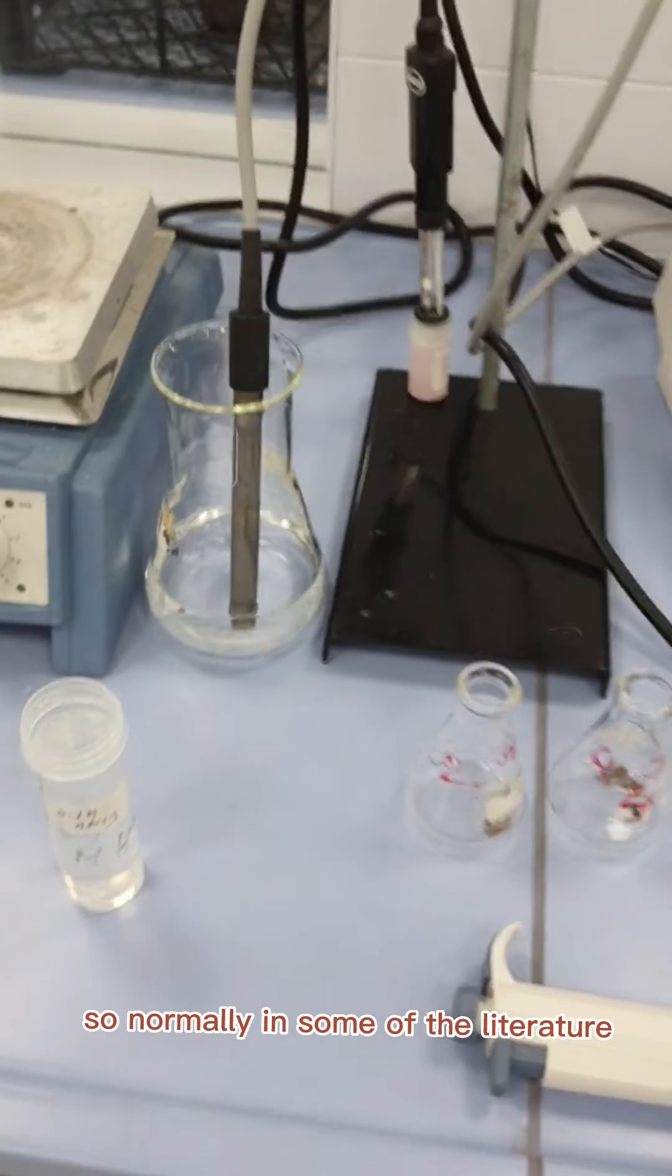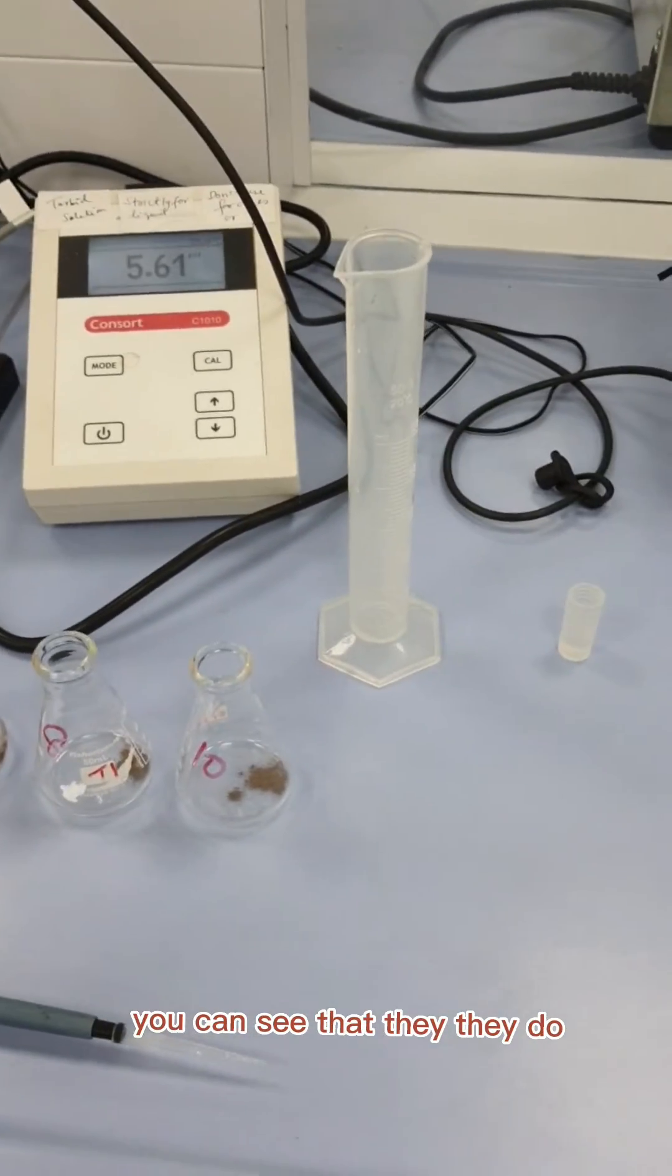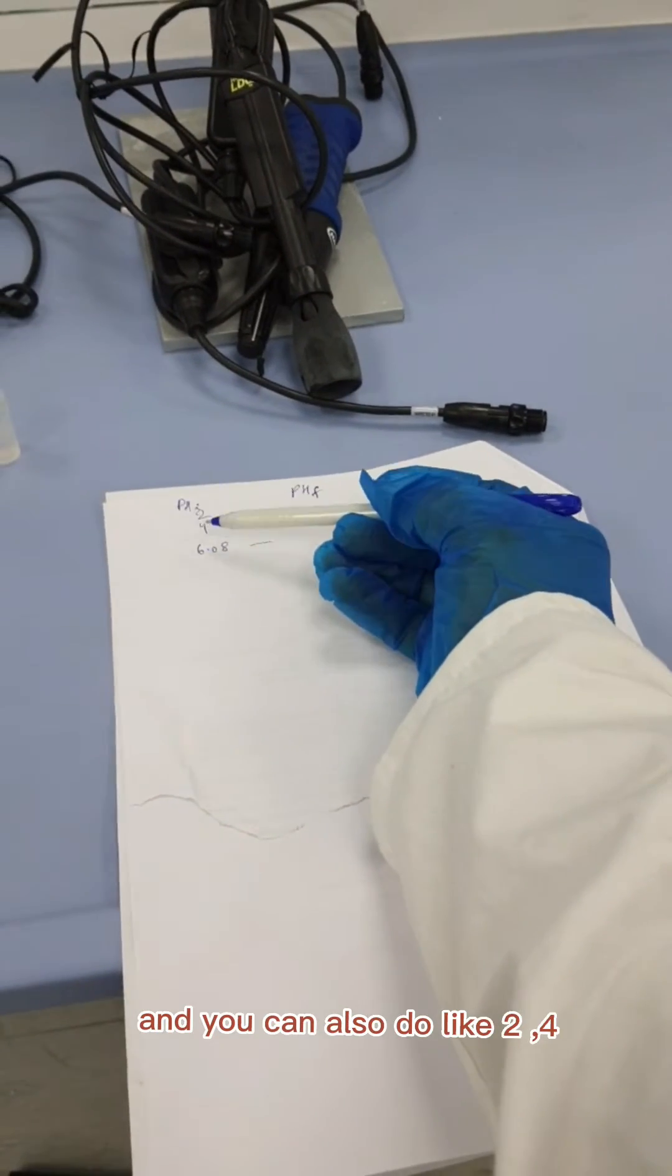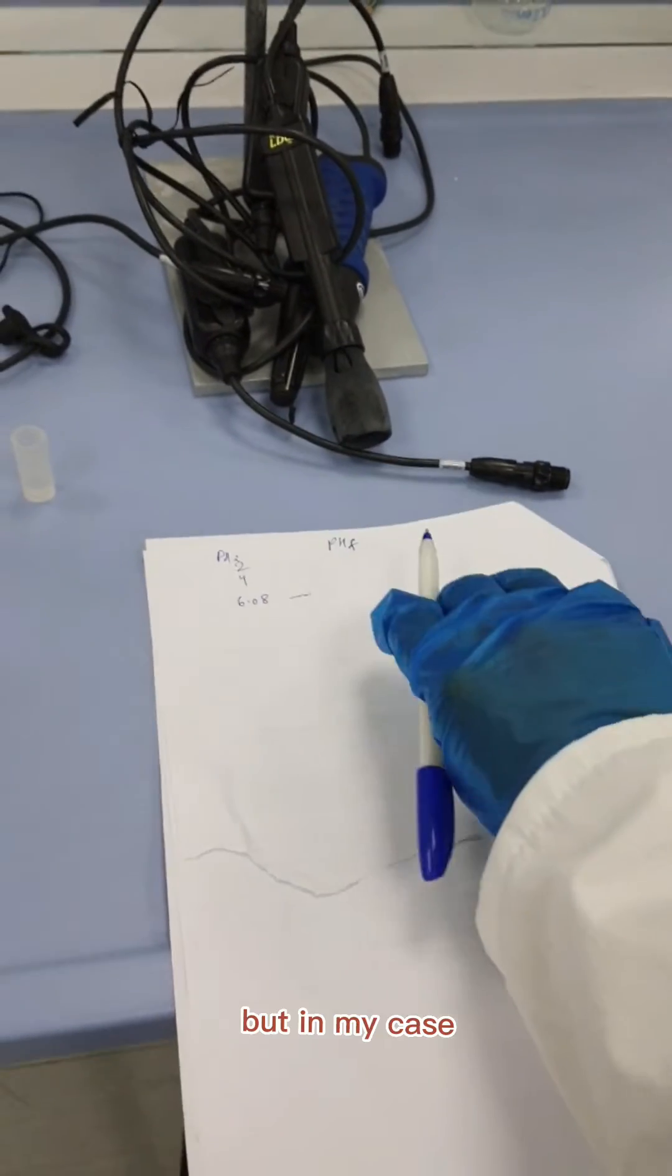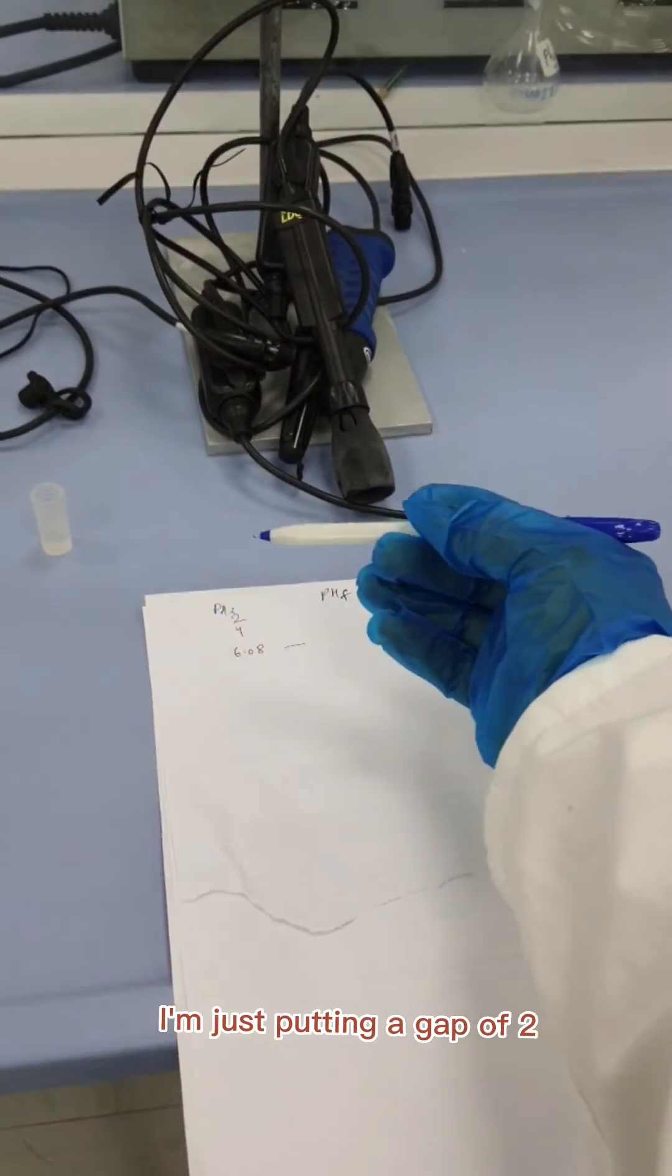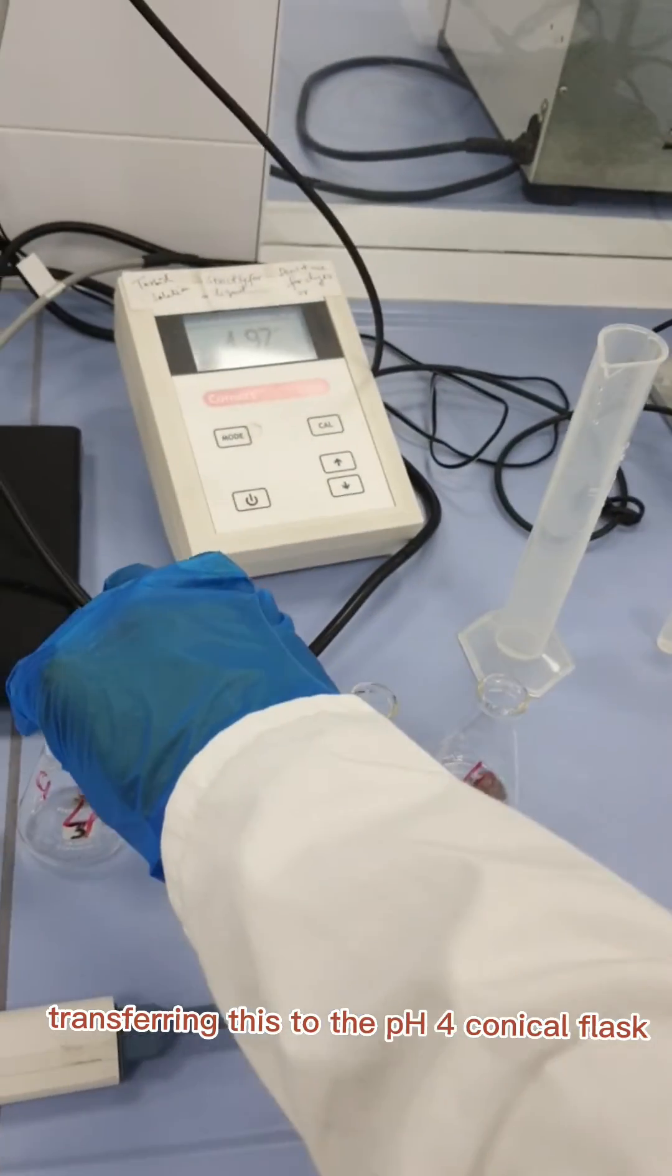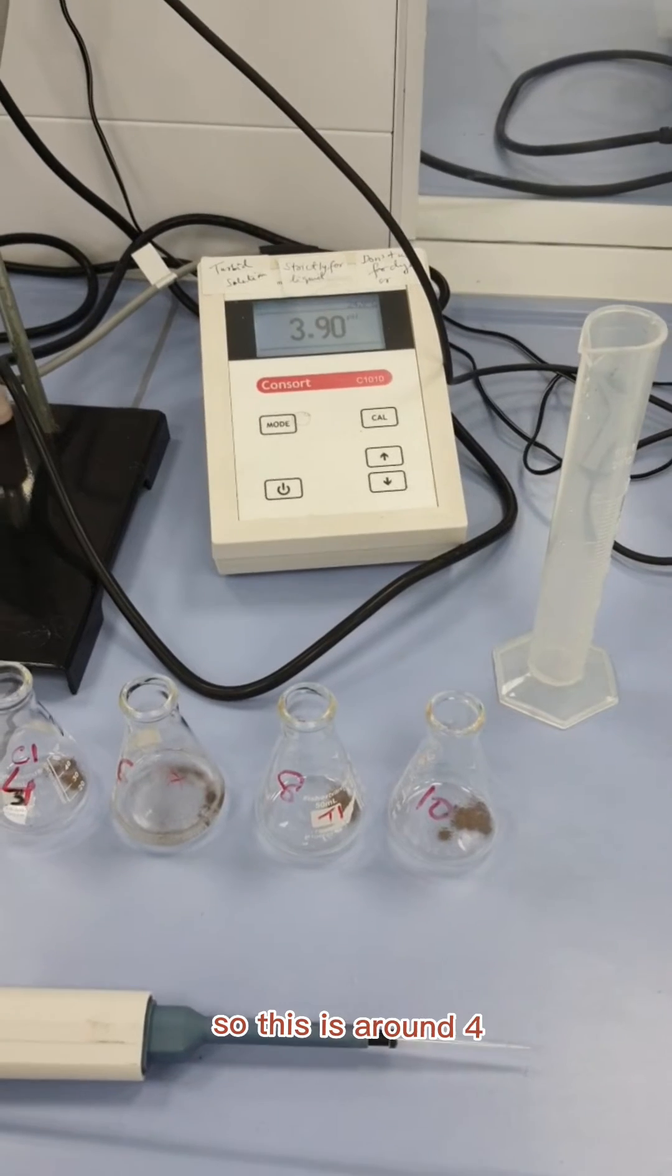Normally in some literatures or books you can see they maintain the pH like 2, 3, 4. You can also do like 2, 4, 6, 8, 10. But in my case I'm just putting a difference of 2. I'm just putting a gap of 2, transferring this to the pH 4 conical flask. So this is around 4.